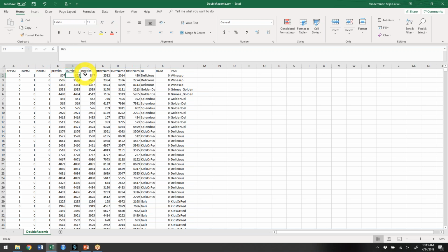So that's something we would have to look at, because it is not given here how large the interval is. And then the next locus is just saying the number on the map of the next marker for which it was certain again that it was a 0. You can see that it's again about 20 markers away. So this is actually a pretty big gap for a singleton. It might actually be a true one if this is over a large enough distance.